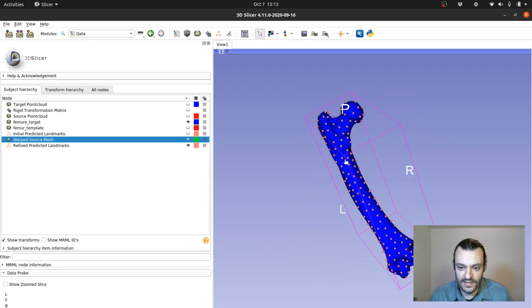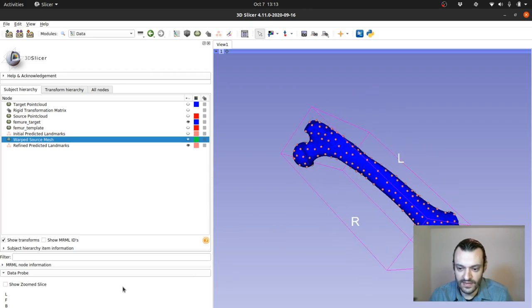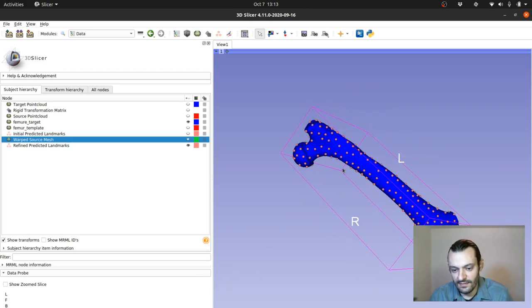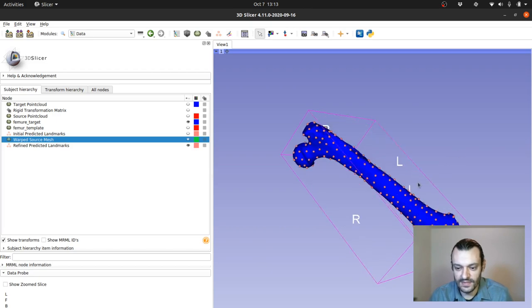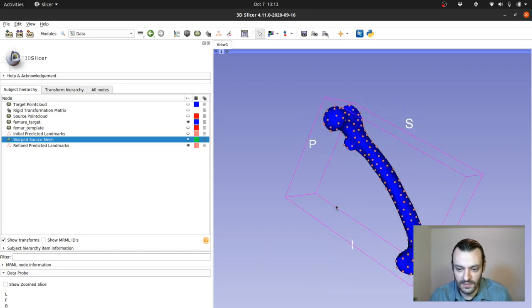And you can see the male mesh, you were able to sample all those landmarks quite effectively. And you didn't have to spend a lot of manual time actually placing those landmarks. It did it completely automatically.